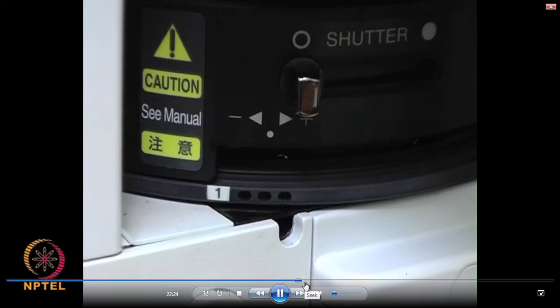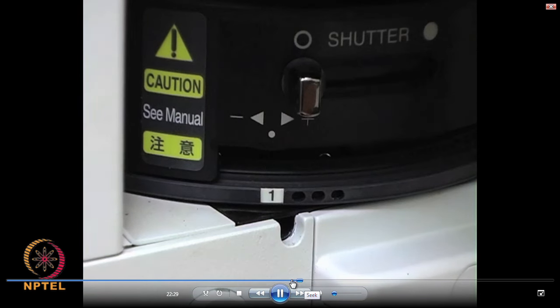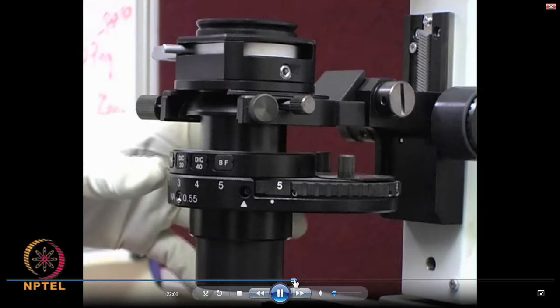Now we will change to phase contrast mode. That means you have to change the aperture, both on top as well as bottom, to the phase contrast aperture and filters. And now you should appreciate this particular, let me go back.